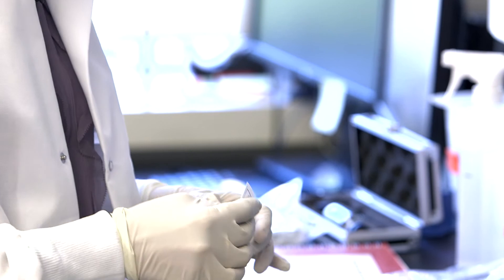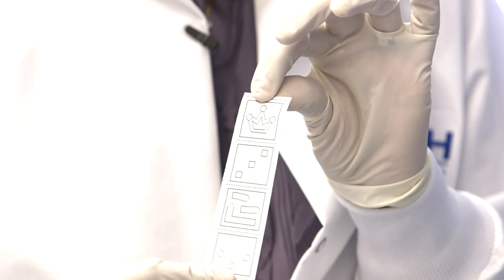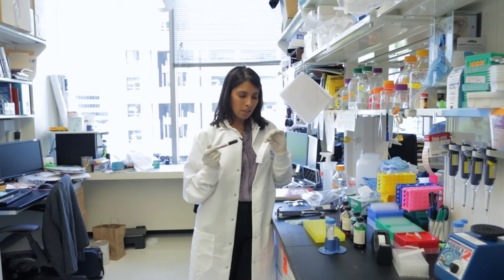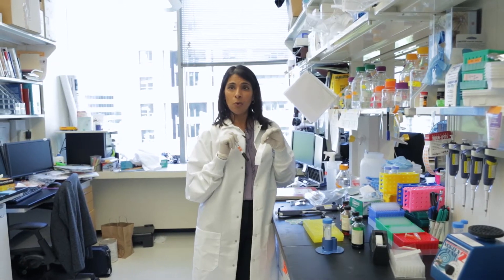The way this works is we start with a simple piece of filter paper, and we print out our pattern, and then we take a commercial hydrophobic pen and you draw, you color, basically where you don't want the liquid to go.